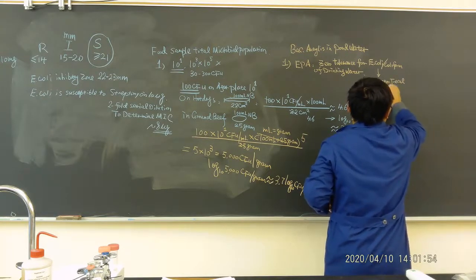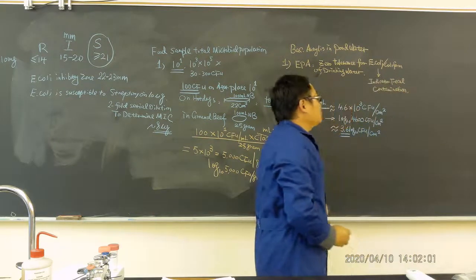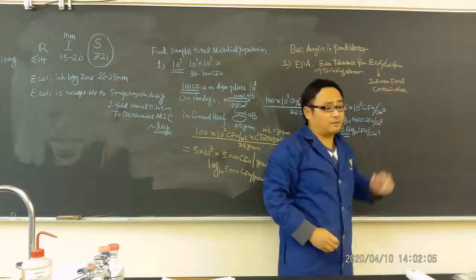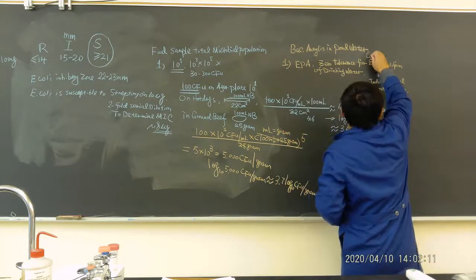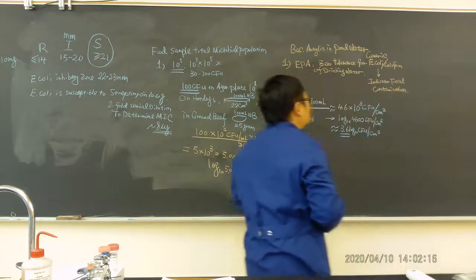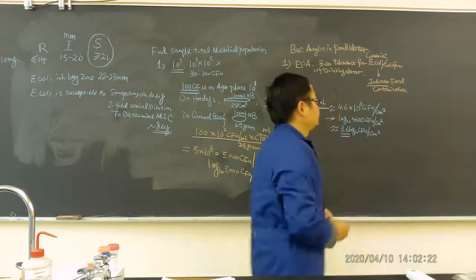And that could be coming from a human being, but most of it comes from animals. Okay? Now, a long time ago, they used coliform to indicate fecal contamination. Right now, they prefer to use E. coli. And here we are talking about generic E. coli, not E. coli O157:H7. So E. coli and coliform, we usually call indicator bacteria.